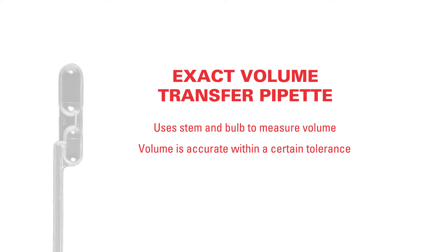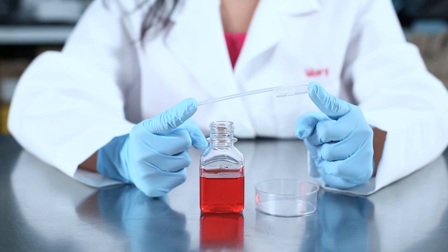It measures this accurate volume using the stem and the use of an overflow bulb, making the Samco exact volume transfer pipette easy to use. This specific pipette dispenses 250 microliters of liquid.